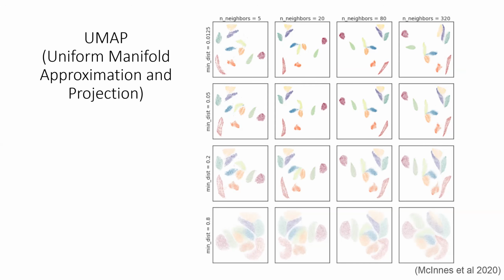The purpose of everything I've talked about today is to prepare the data for cell type clustering. But once we've found the cell type clusters, we annotate the cells. So we index them according to which cluster they belong to. And then if you're interested in, say, the stem cells across different treatment groups, you would compare the differential gene expression of the two stem cell identified clusters in the raw dimension space. So you would use the raw count data to do the differential gene expression analysis.